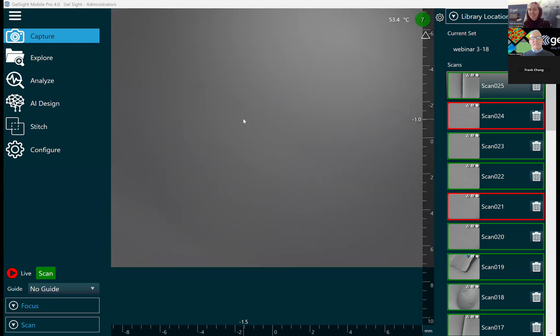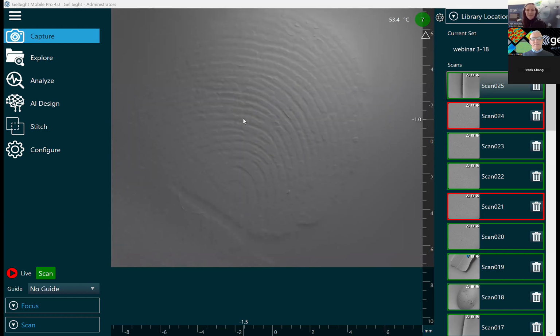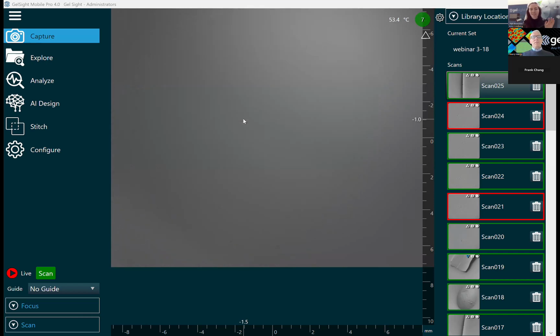I'm just installing the gel cartridge back onto the probe here. The gel is what's going to conform to the surface that we press it onto. I'll press my fingertip into the top of the gel here, and you'll see my fingertip show up on the screen.